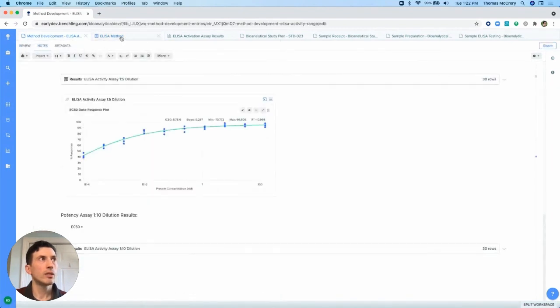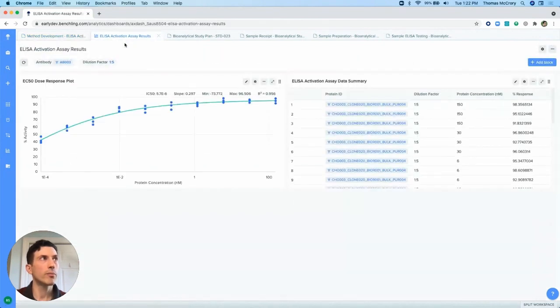All right. So that's one way that we would look to capture those criteria, and then take them forward into an actual bioanalytical study on some ongoing in vivo work. Before I do that, though, I want to briefly look at this data. We just captured this set of raw data, and I had talked about establishing this curve. So I'll do that here through use of a dashboard that will automatically graph it. You'll see the live view of that 1 to 5 dilution factor.